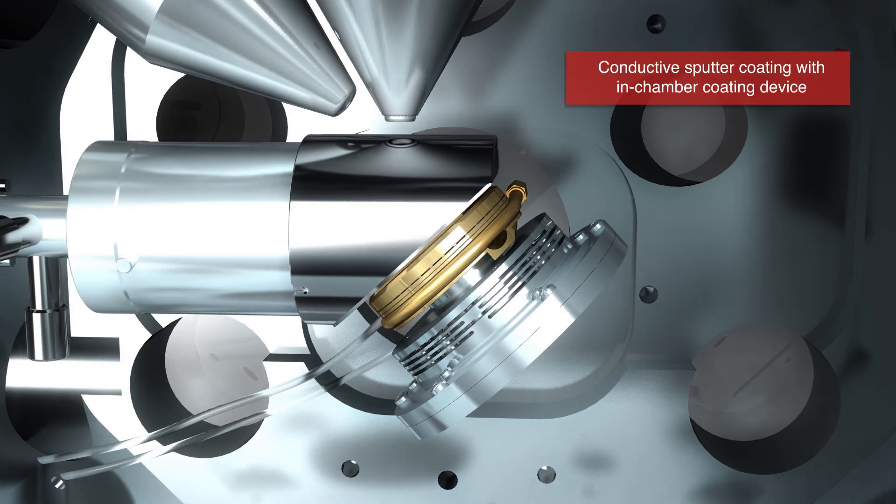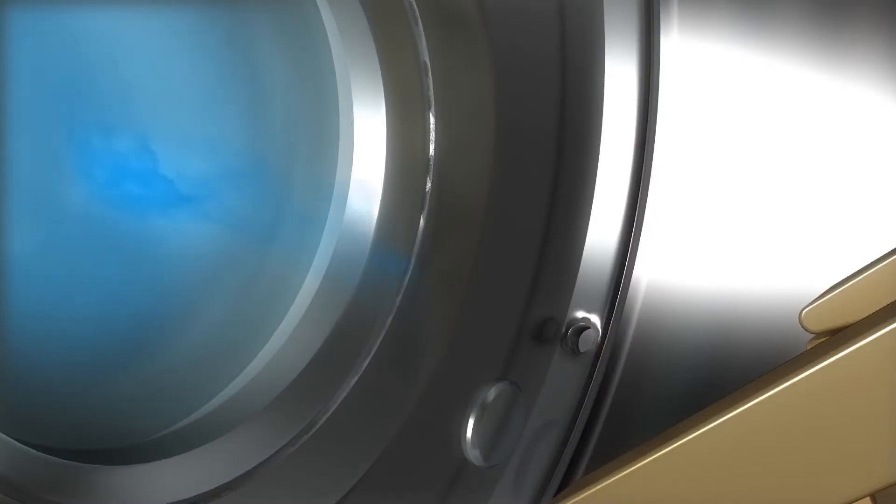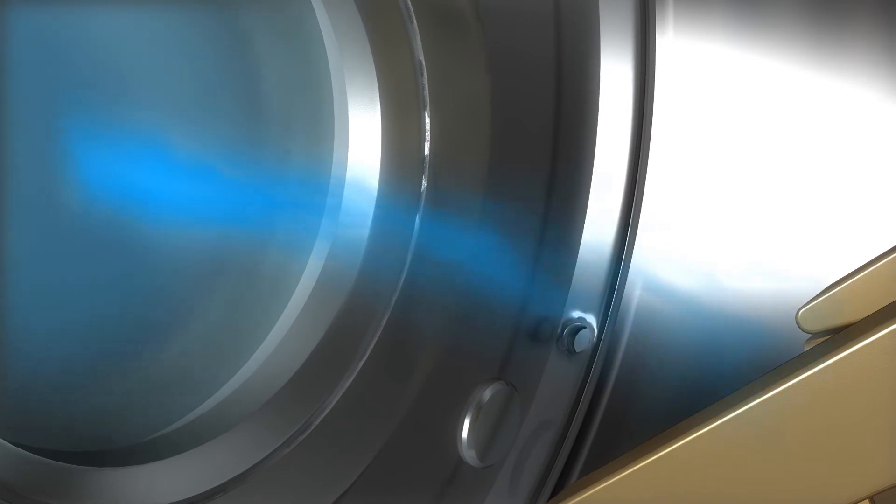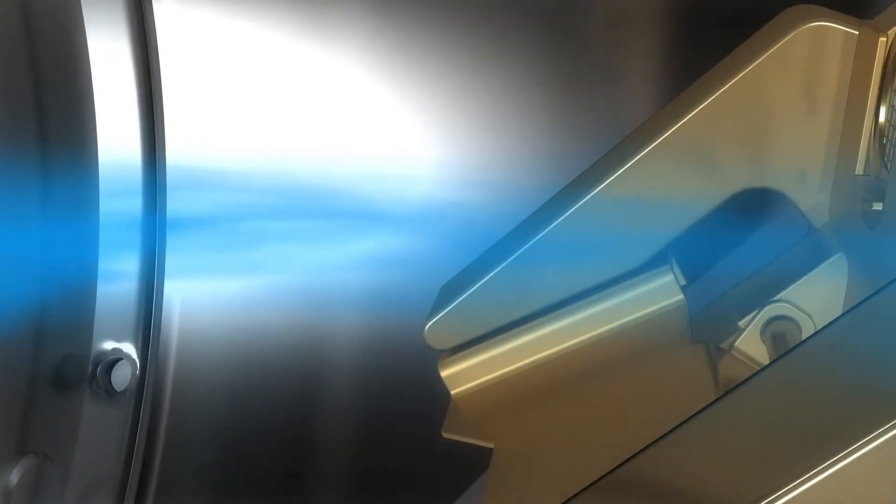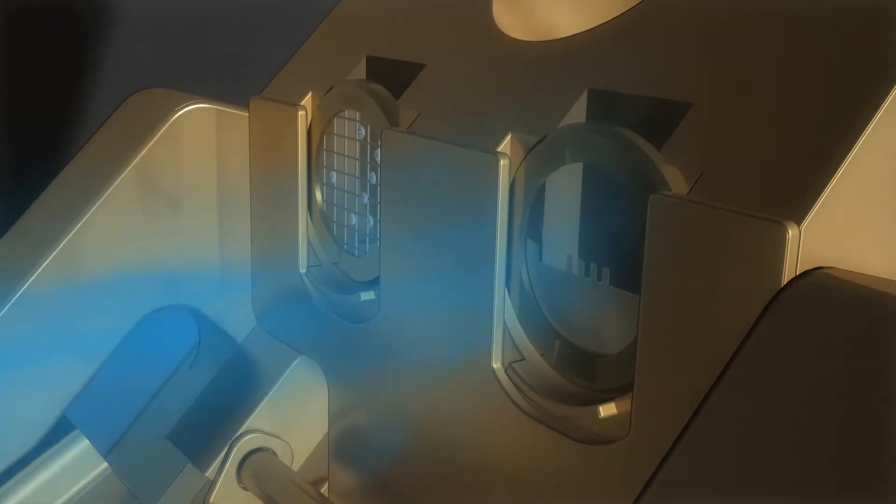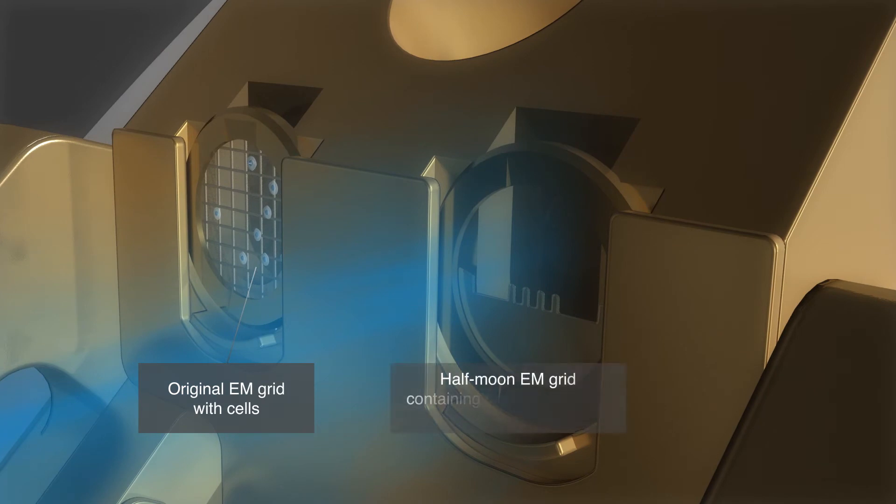In the last step, the in-chamber sputter coating system is used to apply a thin conductive layer of platinum on top of the lamella sample to prevent that it charges up during 3D imaging in the TEM.